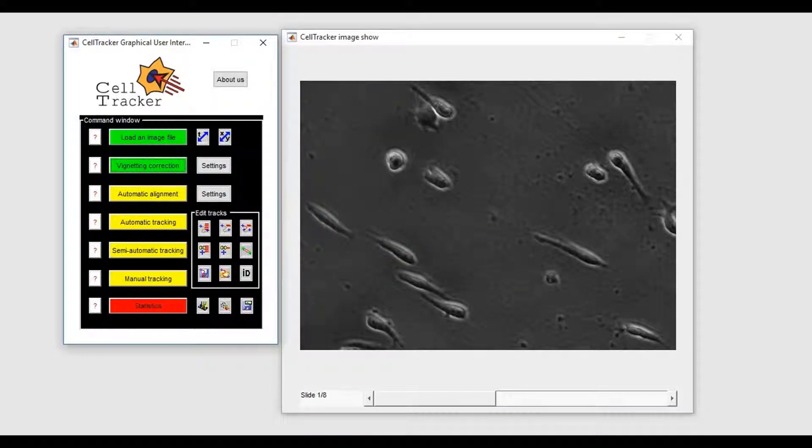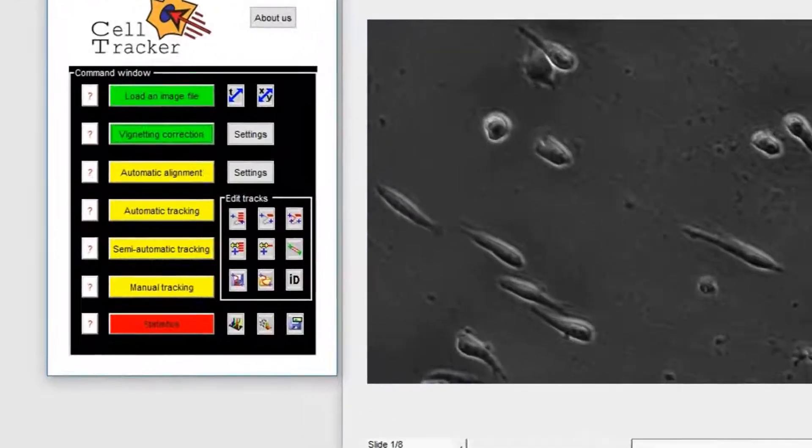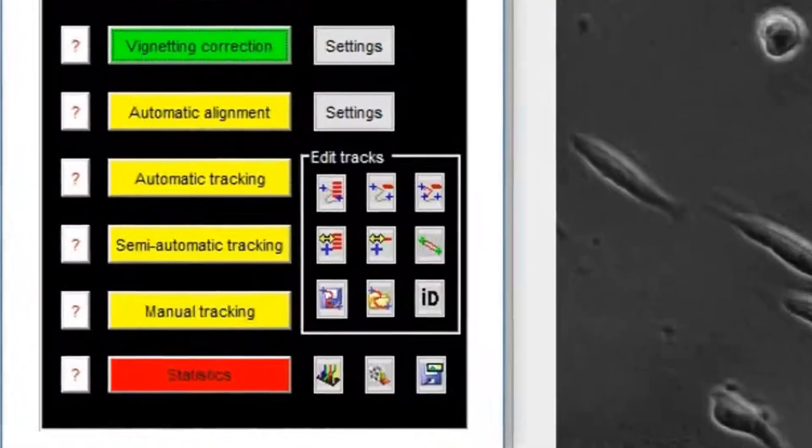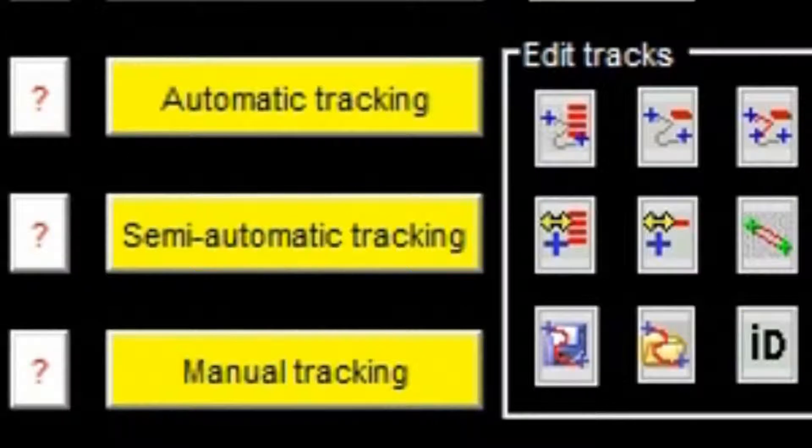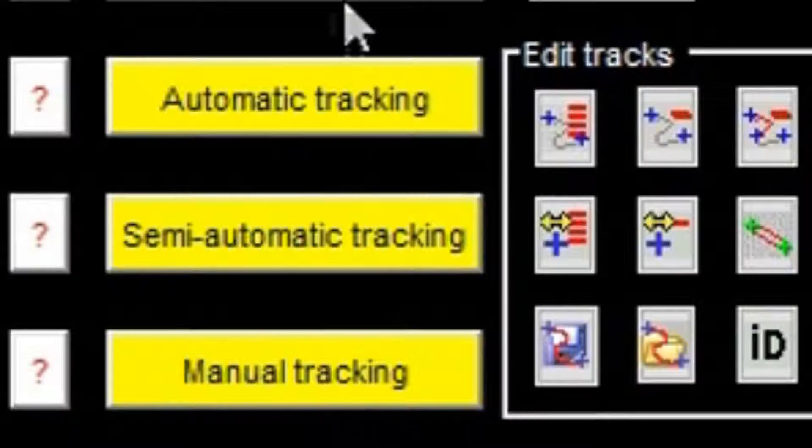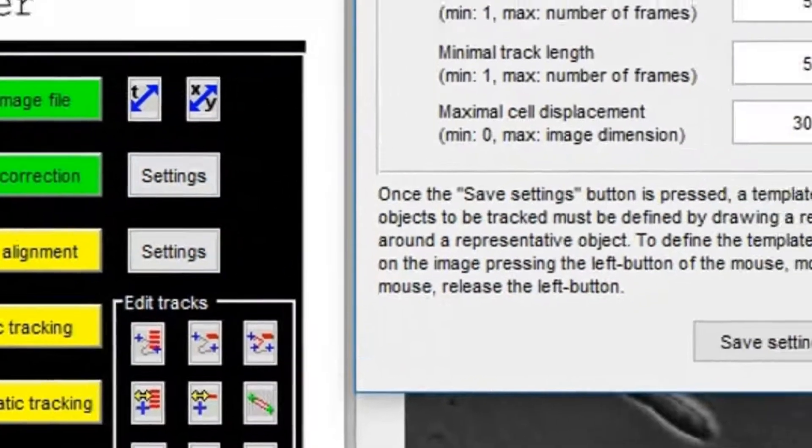For tracking the cells, we have implemented several methods subdivided into three main categories: fully automatic, semi-automatic, and manual tracking methods. Let us start with the automatic modality.